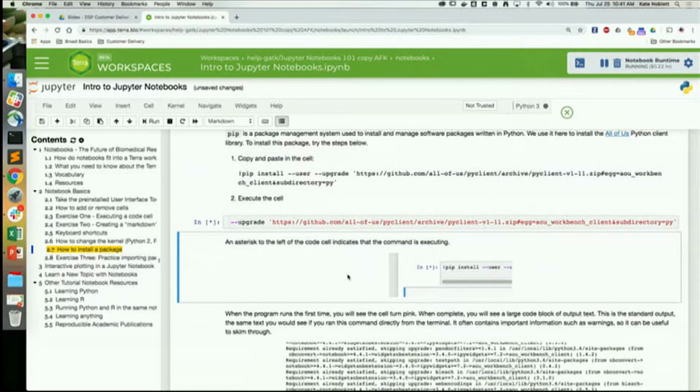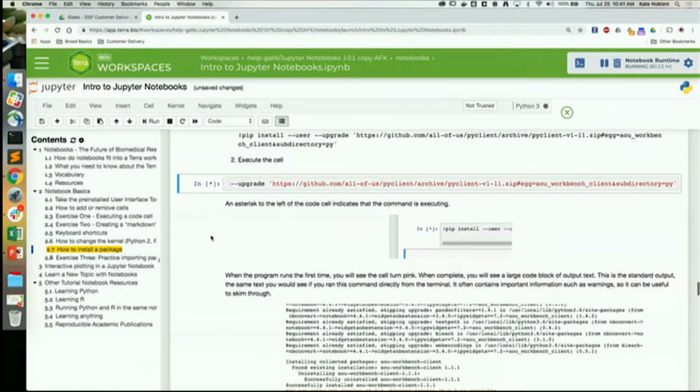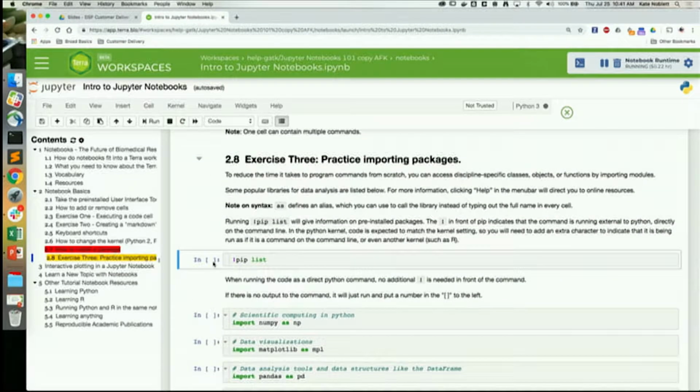And so the last thing I will explain about how the Jupyter notebooks work is this little asterisk over here. So you'll notice that next to every code cell, there is this indicator of whether or not the cell has been run, in what order it has been run since the last time the kernel was restarted, and whether or not it's running currently.